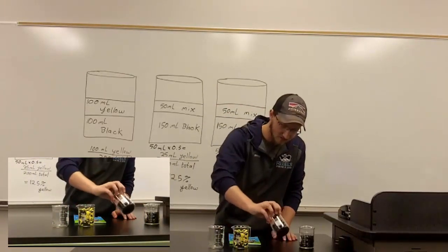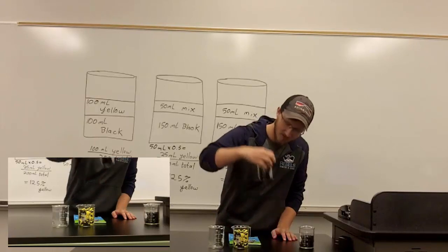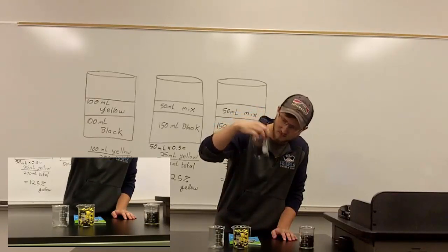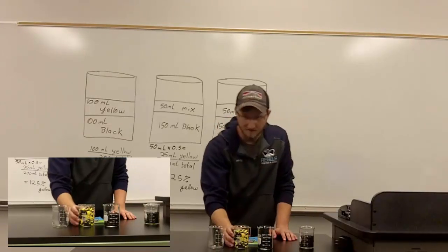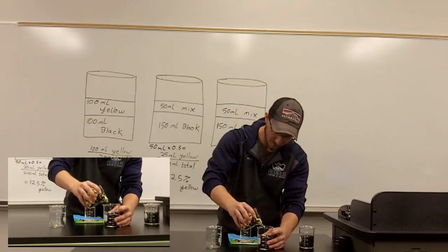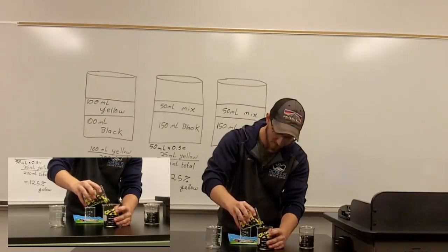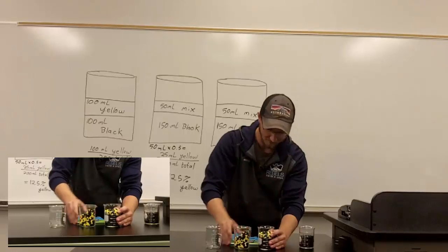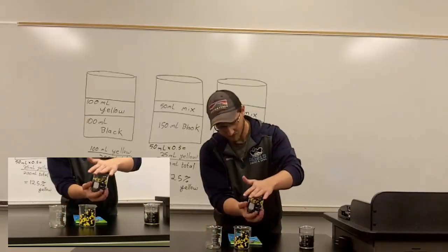And then if you take some more of the black perlers, which is at about another 150 or so, and then you add about 50 of this to get a total volume of 200. So to this top line, it's a lot easier to visualize for younger students because it's solid, they're pouring, it's safe to pour. And then you agitate this one as well.